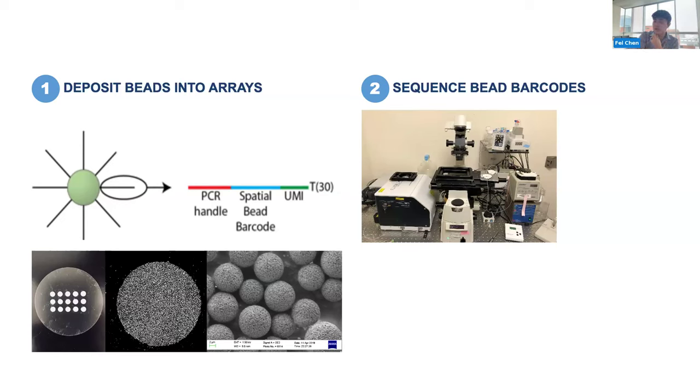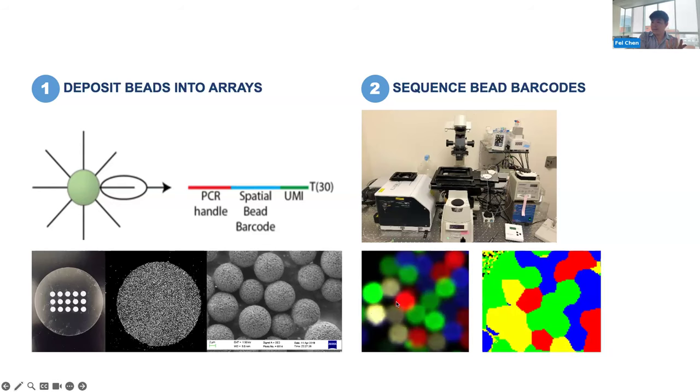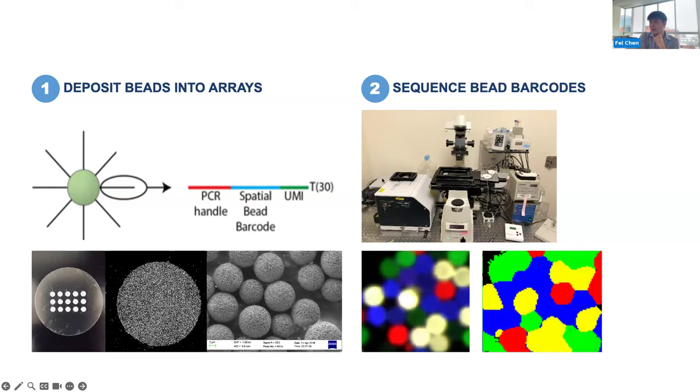but instead of taking a picture, it's capturing a picture of the molecules inside the tissue. But these beads are randomly deposited, and so to actually get the array, what we're doing is sequencing this bead barcode with a custom microscope.